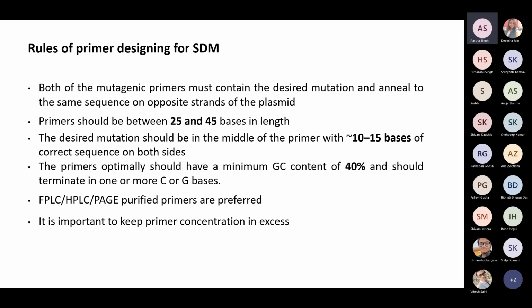With desalted primers, you can also do an SDM experiment. It is not impossible, but everything gets a little bit easier if you have your purified product. Now, it is important to keep the primer concentration in excess because this entire technique is based on your primers, right? So the primer concentration should be a little in excess.